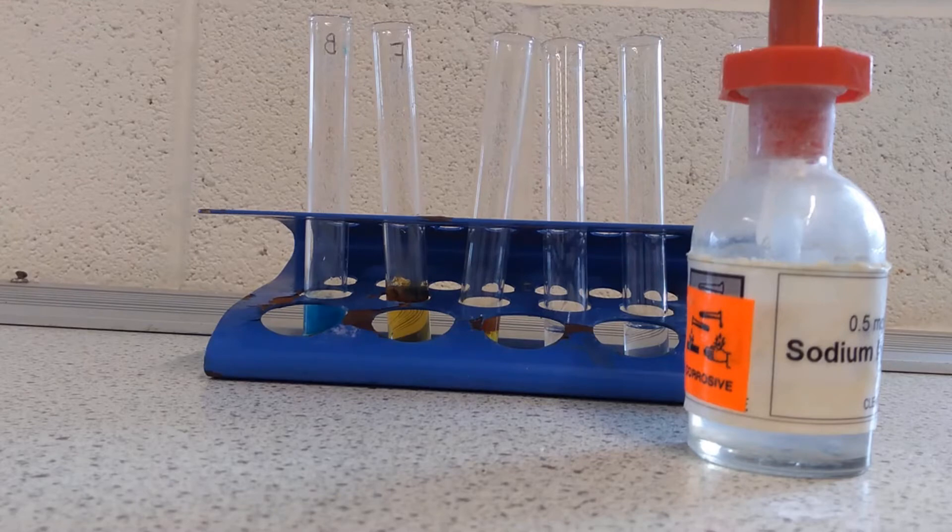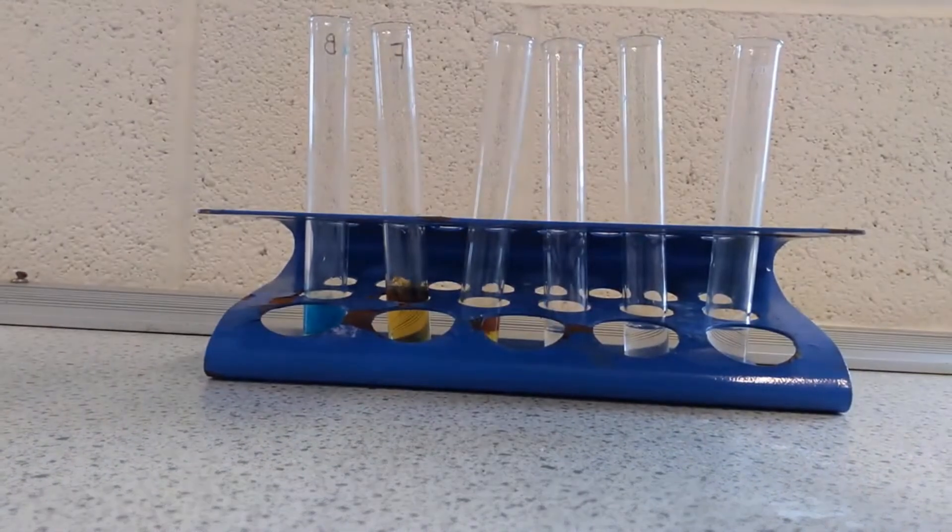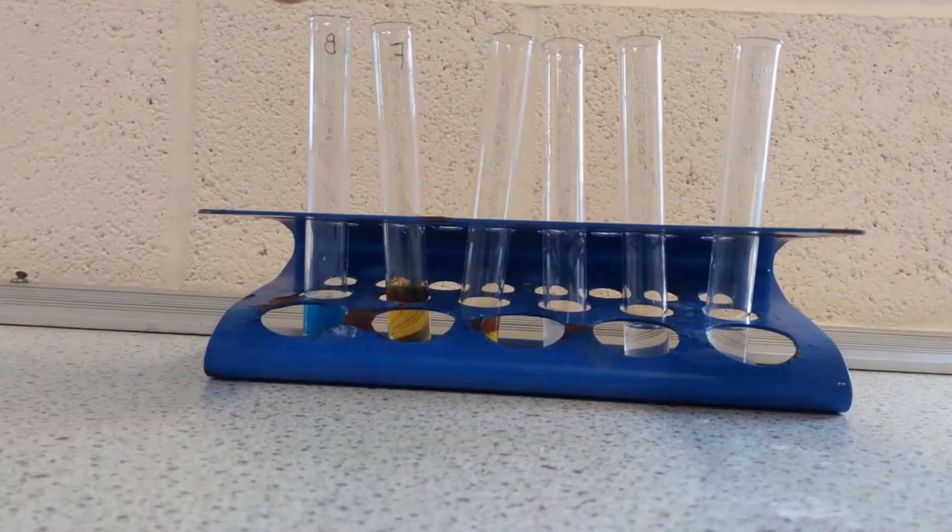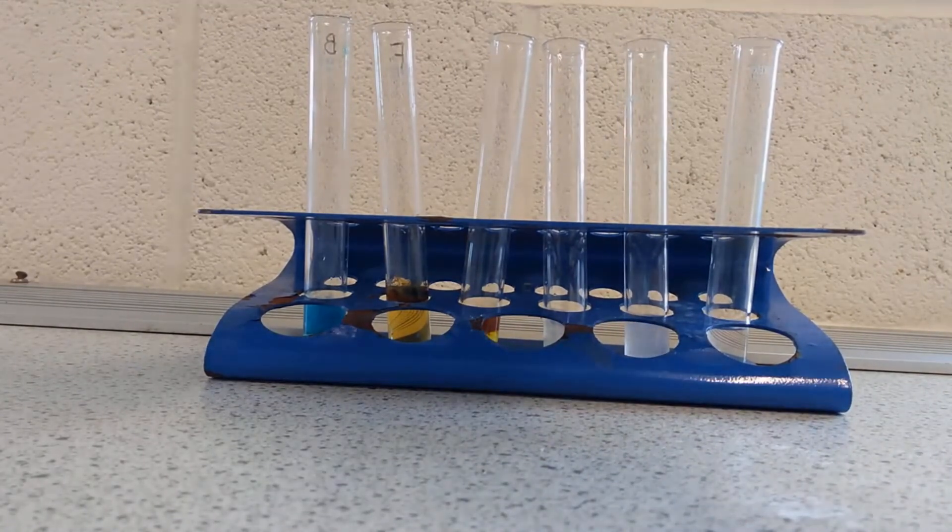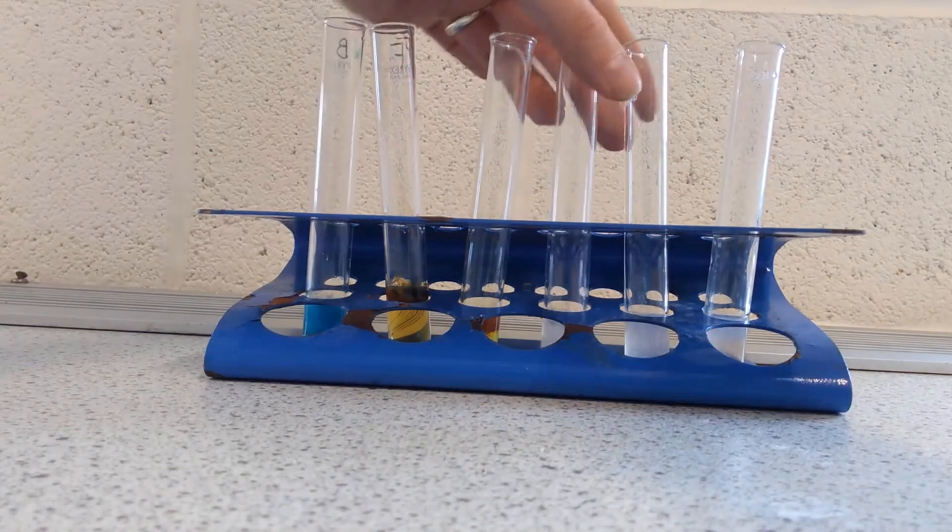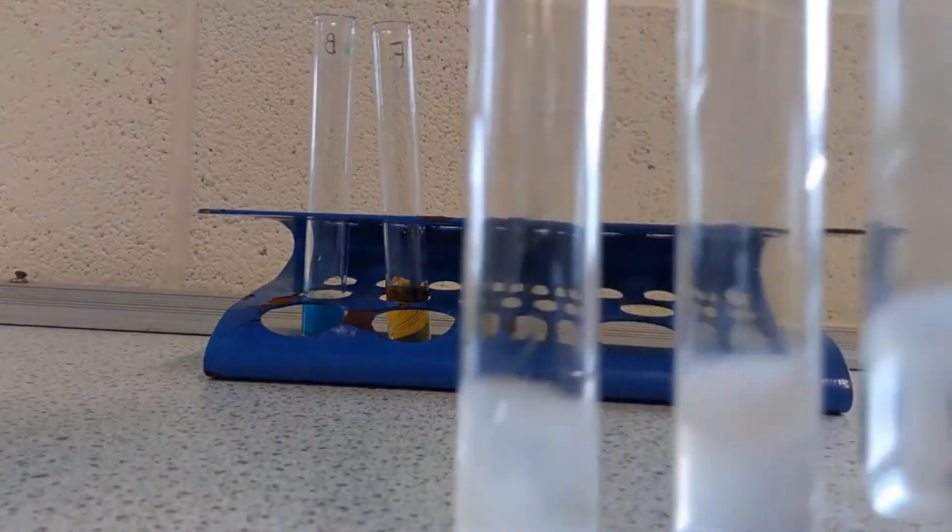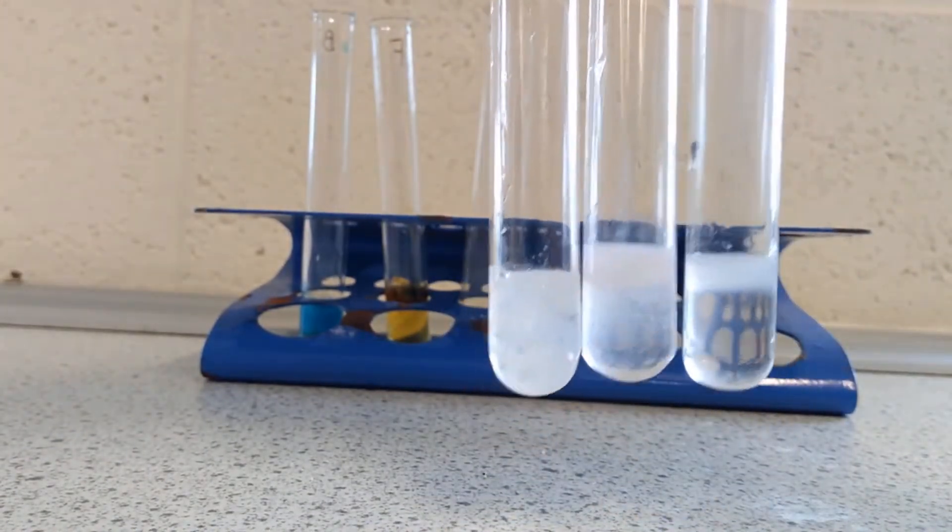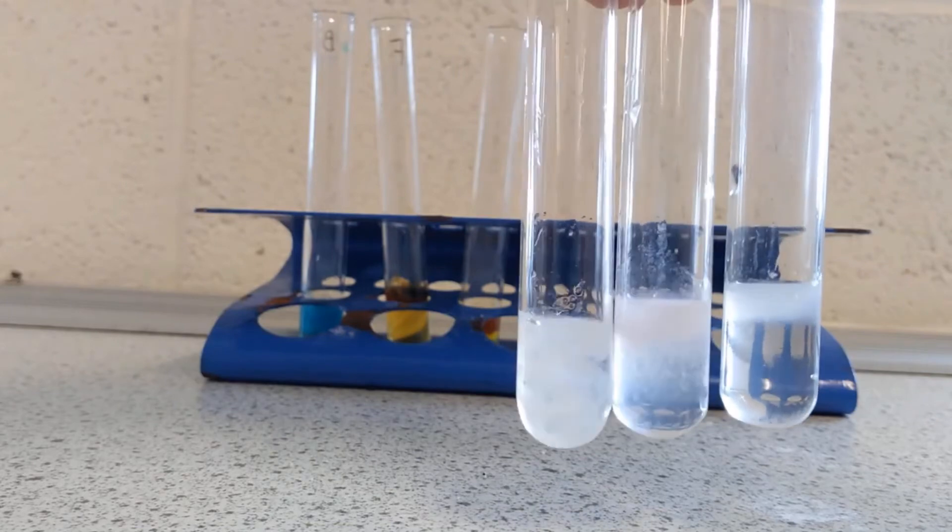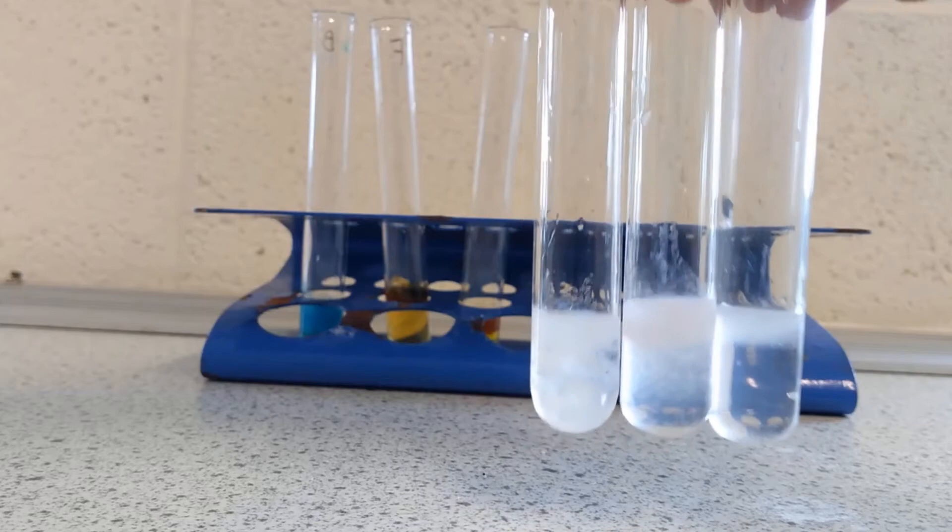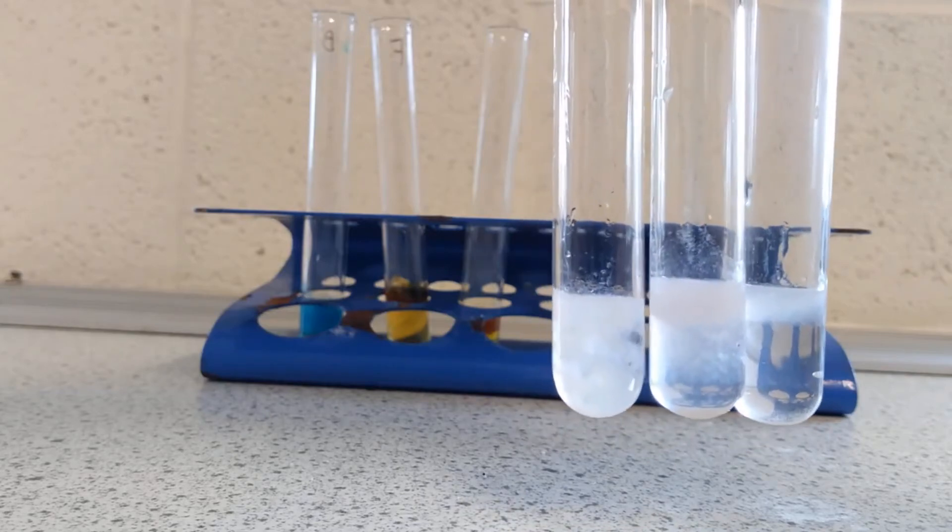Now my last three are a little bit harder to tell the difference between because they all form white precipitates. So these are calcium and magnesium and aluminium salts, and you can see they don't look identical to each other, but they are all forming a white precipitate. So that's not hugely useful. It means I can tell that it's one of the three, but I can't tell which one it is.